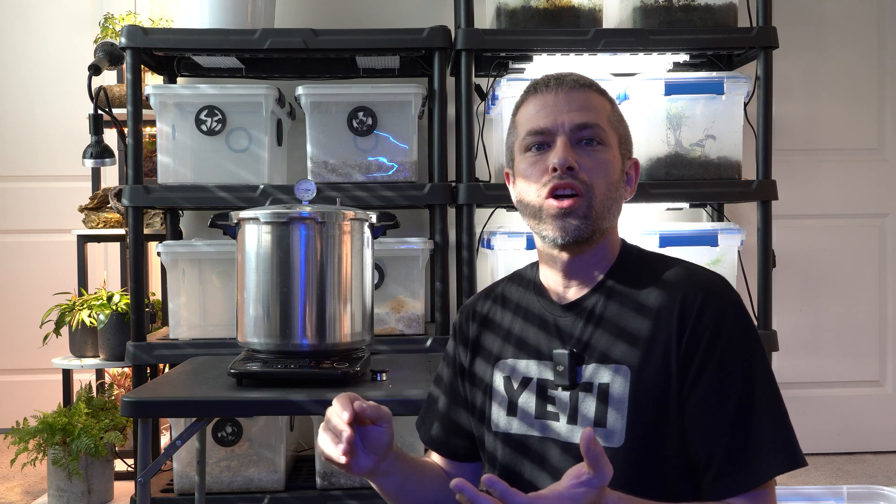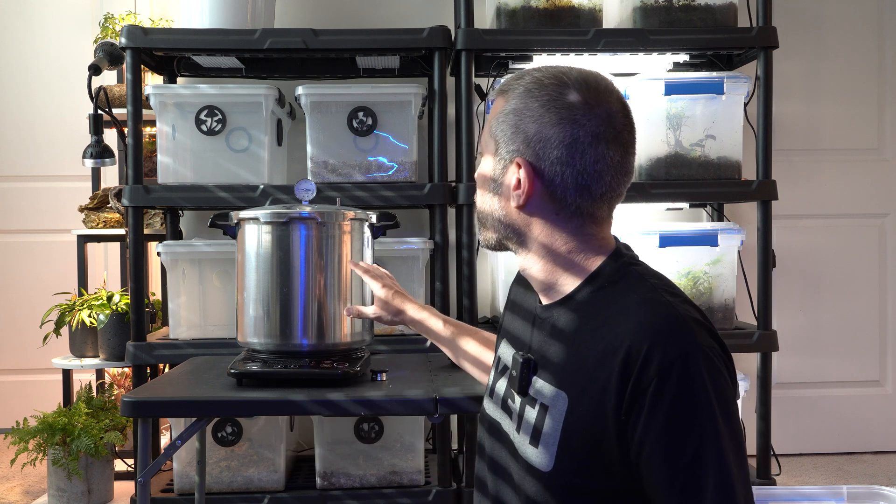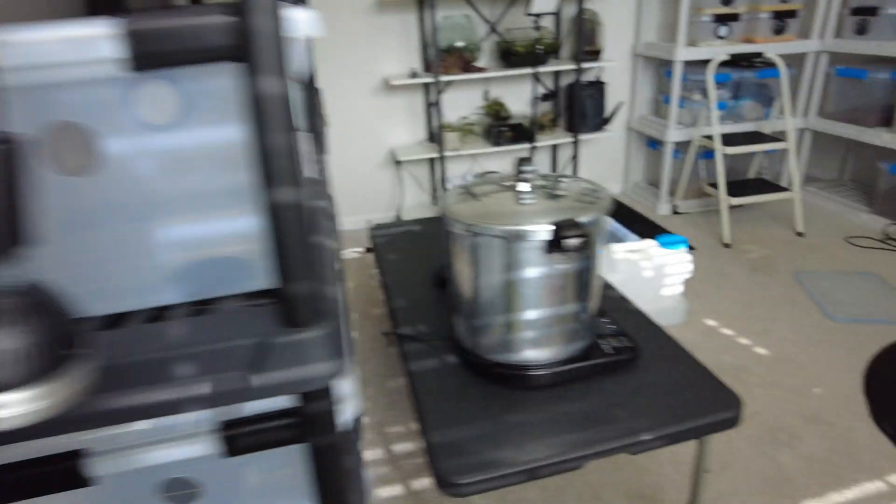So we took regular dry rye berries, filled them in the jars, topped it off with a little bit of water, and the pressure cooker is going to do the job of all the simmering and drying that I'd previously done. The pressure cooker is going to take care of all of that for us. Let me take you on a journey — I've got some plants waiting in the shower that I was watering this morning.